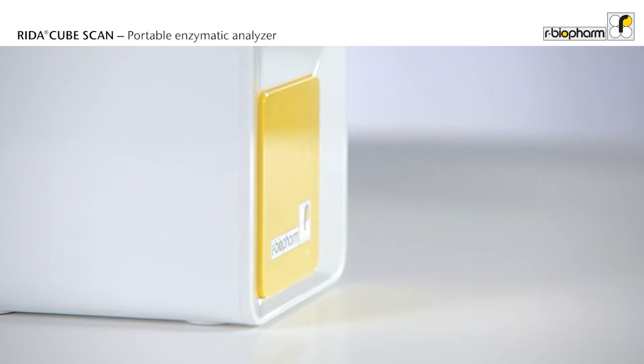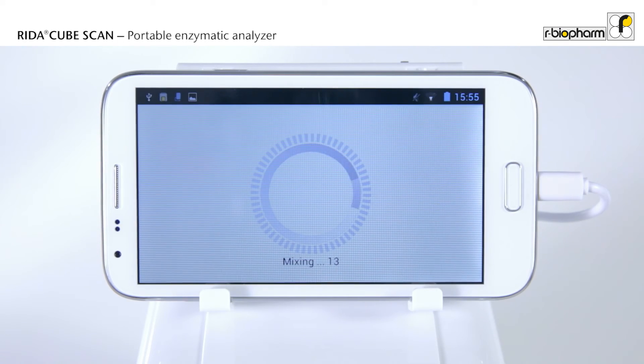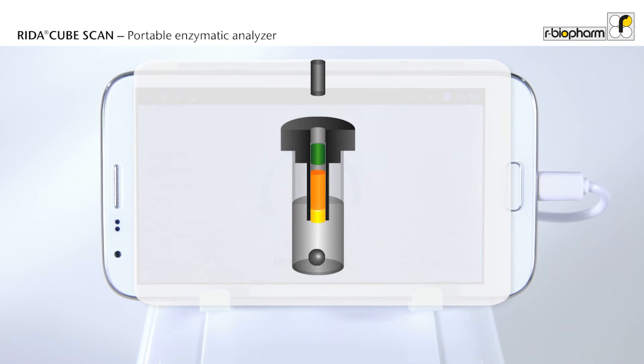Insert the tube and close the door. You are now finished. The RIDAR CubeScan will perform the entire test automatically. During the test, a plunger pushes downwards in the center of the cap. The reagent passes from the cap into the tube and the reaction starts.